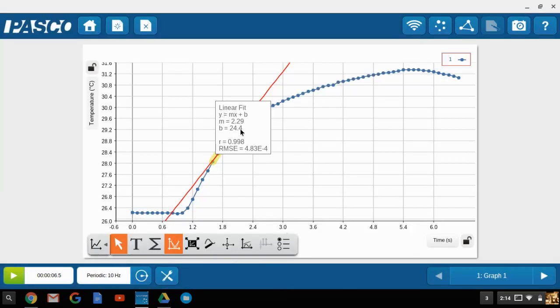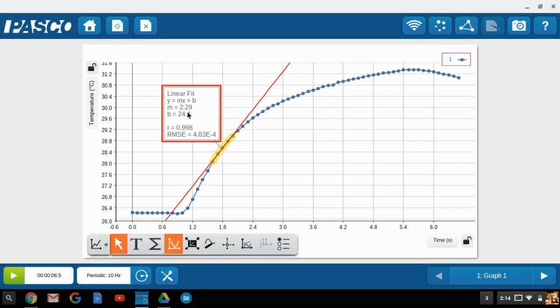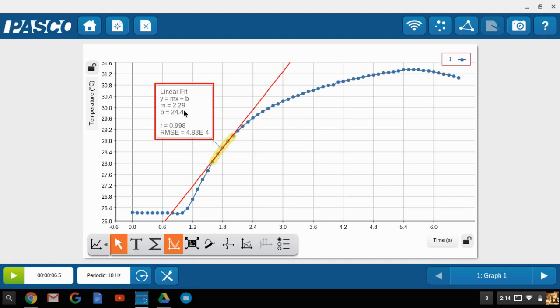Now position the curve fit equations away from the line so that you can capture all of this data within the screenshot. Once you've composed the graph in a way that you want to display the data, then go ahead to the upper right-hand side and click on the camera icon to take the snapshot.